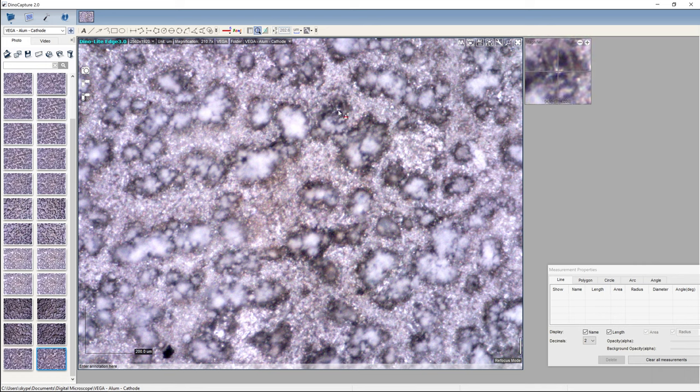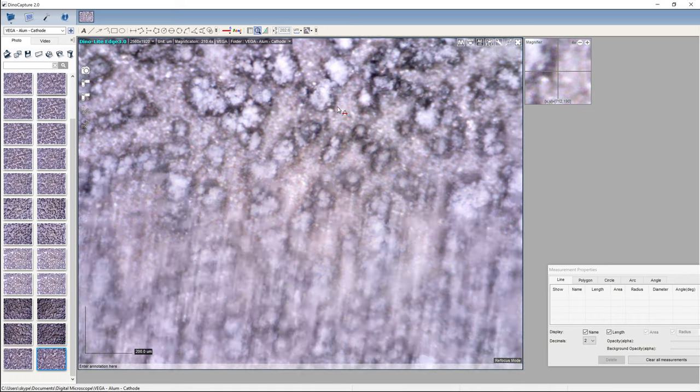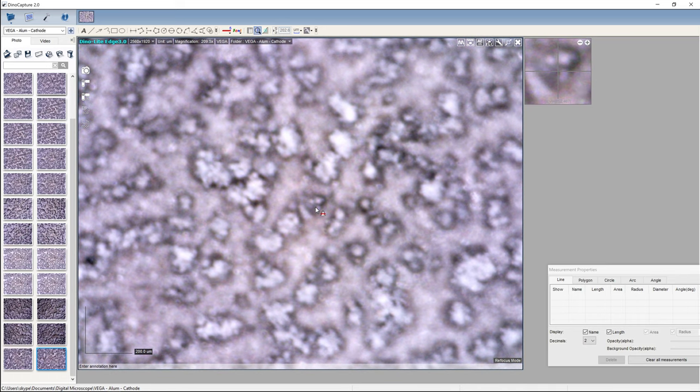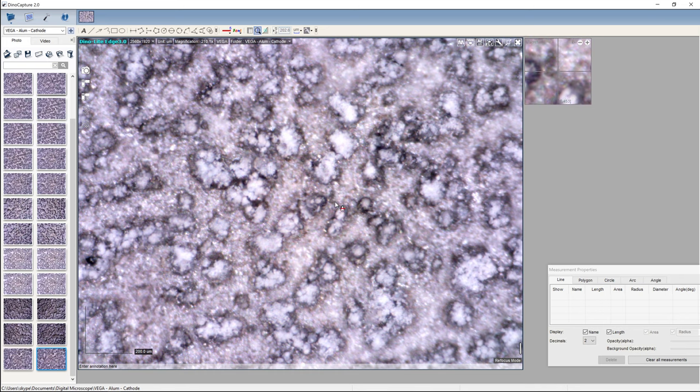Quite a bit of variation here. Again, one of these shiny blobs. If there is iron on here, I would think it would be in these features. Like that. Look at that. I would not be surprised to find that that is iron, that spherical feature there. Very different from the base here. Very different from the white fluffy bits.